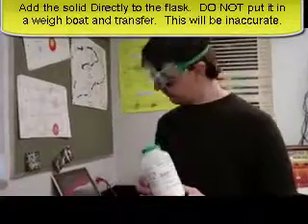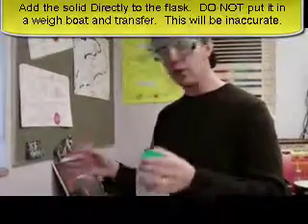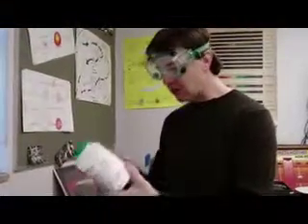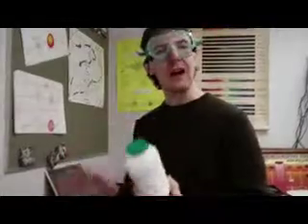And guys, a recommendation when you're doing this is you should add it directly to the flask. Don't put it in a weigh boat and transfer. If you put the flask directly on the balance and weigh it directly in there, you know you're not going to miss any of it. If you use the little weigh boat, some of it can stick to it with some static electricity, and you never get it accurately all in there. So yeah, weigh it directly into the flask.